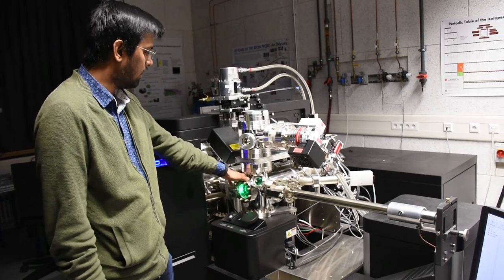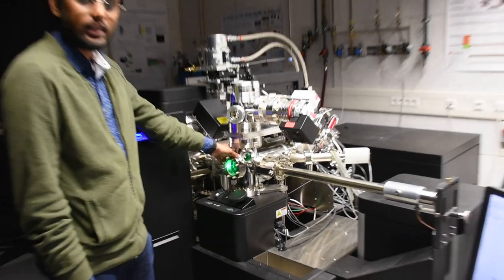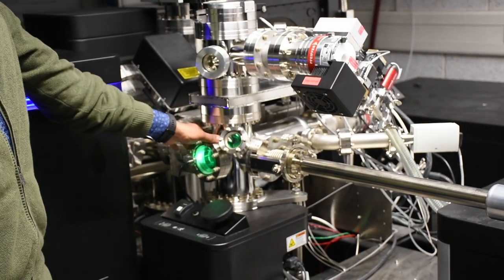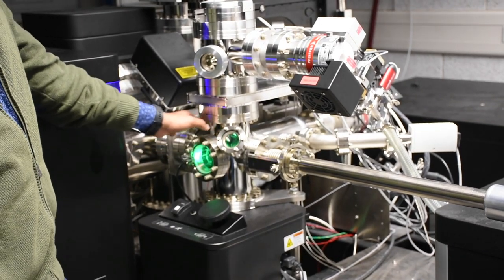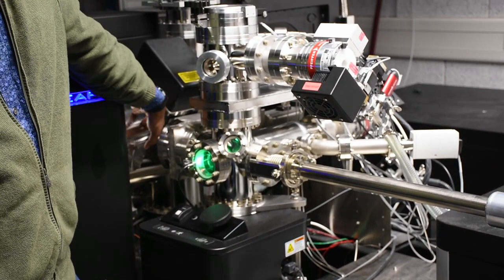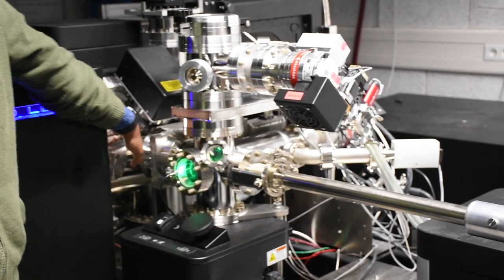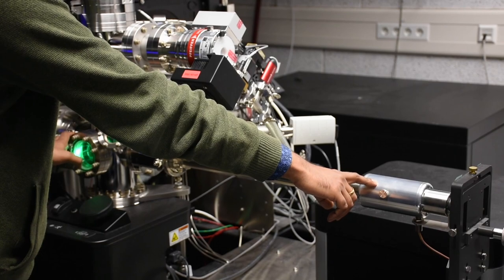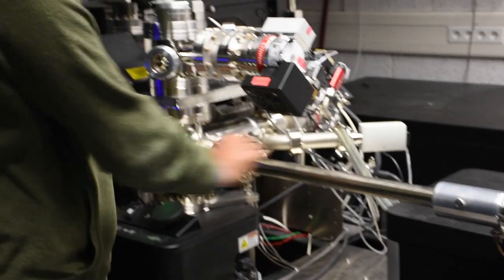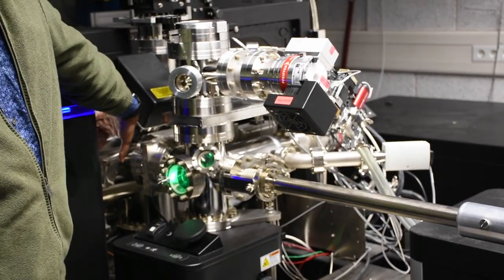Now that our sample is inside our buffer carousel, we waited for the pressure to get good so that we can open the valve between the buffer chamber and the analysis chamber. To move the sample from the buffer chamber to the analysis chamber, we use the horizontal manipulation rod, and we lock in our sample and move it to the analysis chamber.